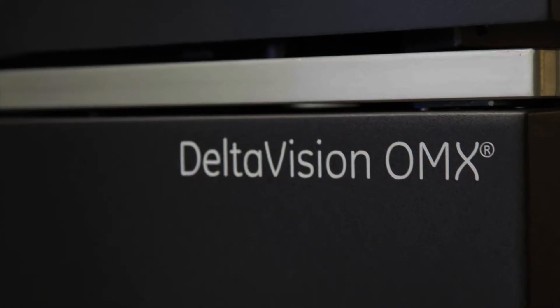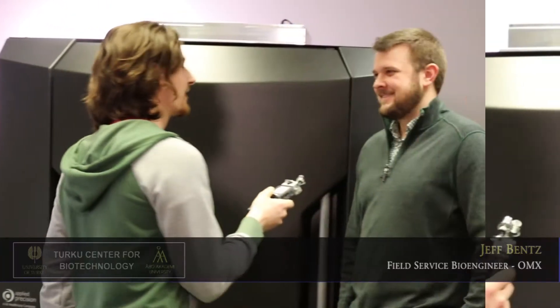Hi, I'm Ciaran and I'm part of Turku Bioimaging. Today we're actually going to be looking at a new microscope that's been set up, the DeltaVision OMX, and we're going to speak to one of the engineers that has set it up today. Can you tell us a bit about yourself?